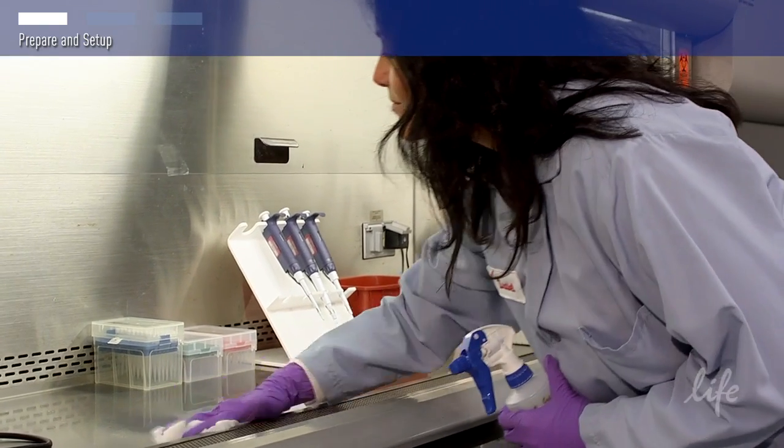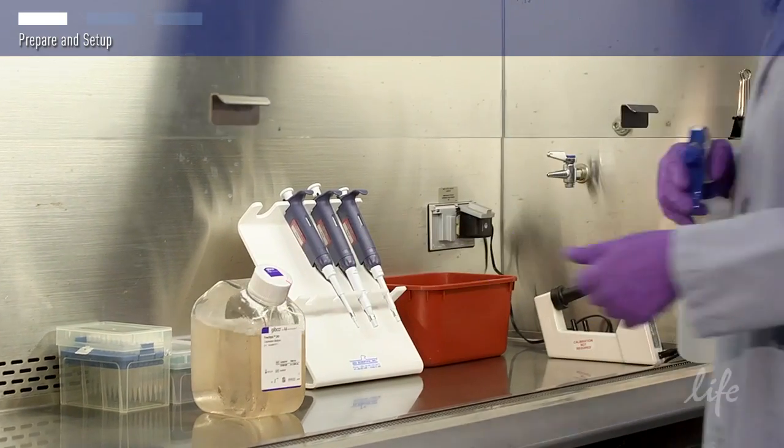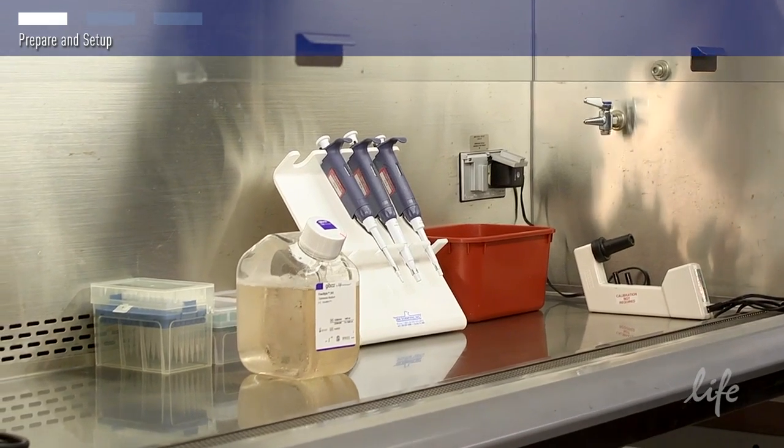Have you thought about expressing proteins in mammalian cells? This video will provide a quick overview on how to set up your lab for mammalian transient protein expression.